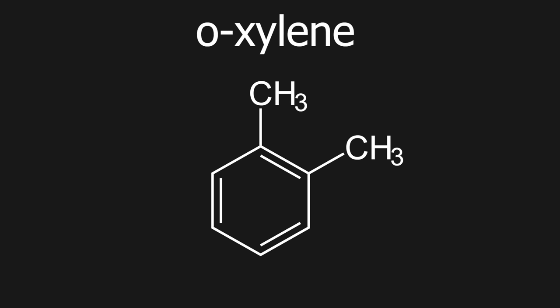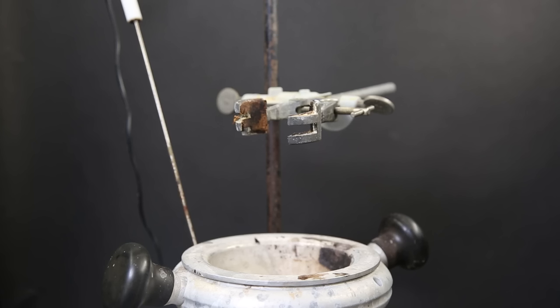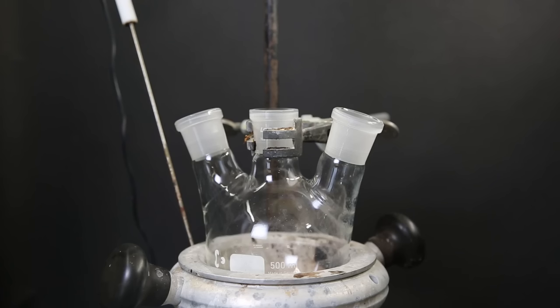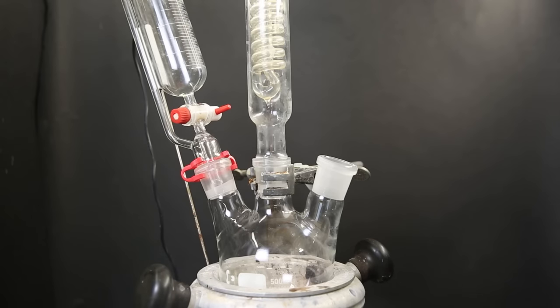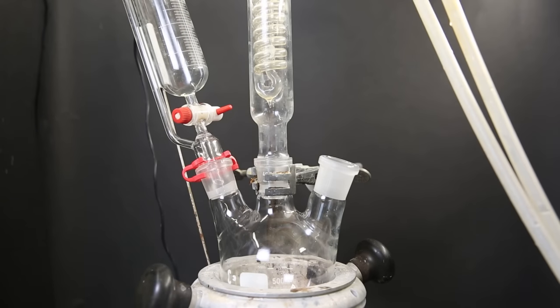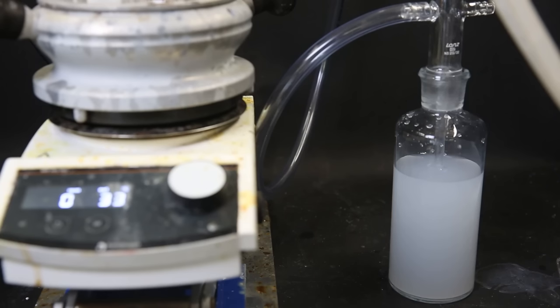For the first step, I will have to brominate the methyl groups of o-xylene, as it is one of the reagents in this synthesis. So to get started, I set up a heating mantle and a 3-neck flask. I drop in a stir bar, and then attach a dropping funnel on the left and a condenser in the middle. Now to the top of the condenser, I attach the gas adapter with a hose that leads to a gas washing bottle containing a saturated solution of sodium thiosulfate. This will neutralize any bromine vapors that escape.